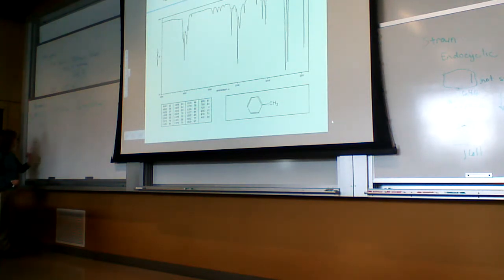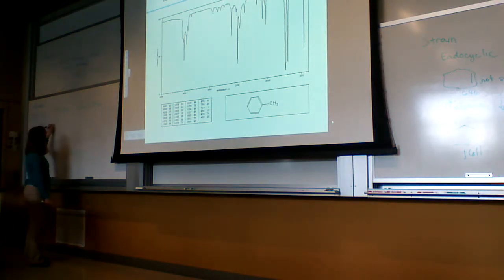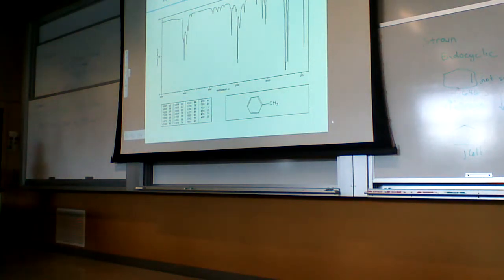There are lots of possibilities for the different stretches here, and they tend to show up in pairs around 1600 and 1450 cm^-1. Depending on substitution patterns around the ring and what is attached, you're typically going to show more than just one. You usually see two at least.